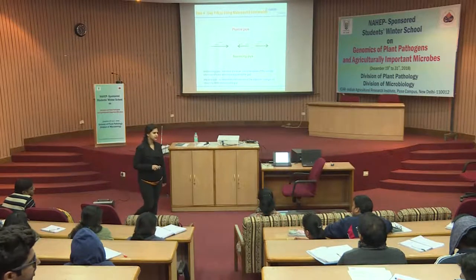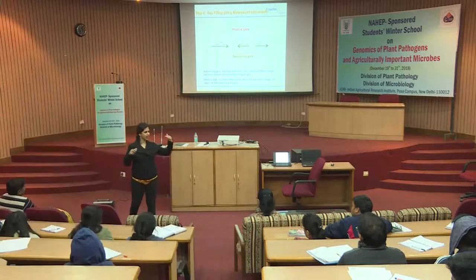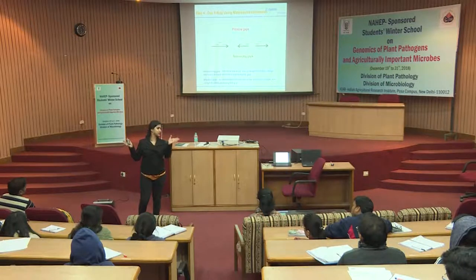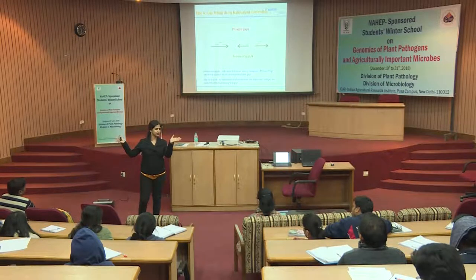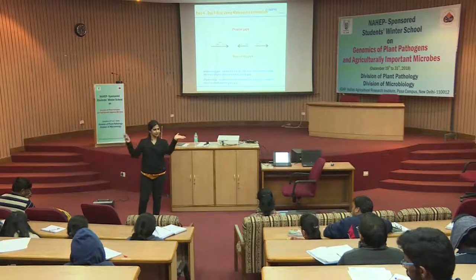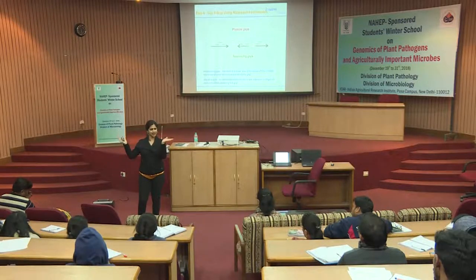So where are we getting that information? In sequencing, we have an R1 and R2. In the library, I am creating a 1 KB MatePair library. In the MatePair 1 KB, I just have a base of 150 and 150. The rest is all information that something is there in between. There is a distance between these two reads. The assembler tries to assemble in that distance.